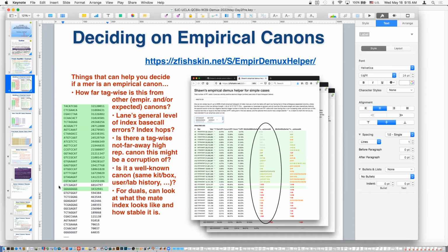But if the I2 hits nothing in the list, if it's weird things, or spread along a huge number of user I2s, or if the first I2 is a 2 mismatch away from one of the user ones, then that sounds less real.